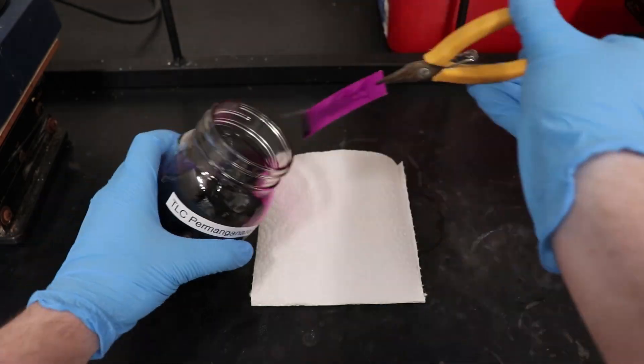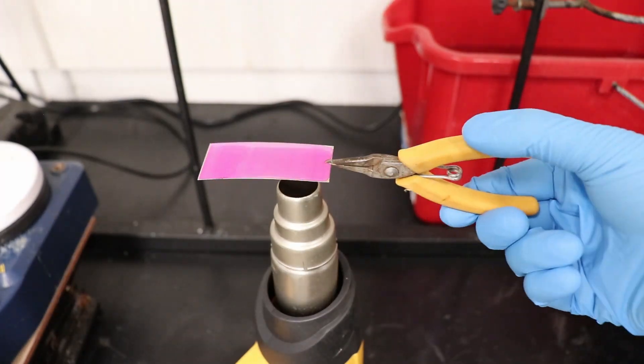I tried a permanganate stain and it seemed to only develop the fenbufin spot and maybe a bit of the biphenyl. And when I heated the plate, it all just turned into a uniform brown color.